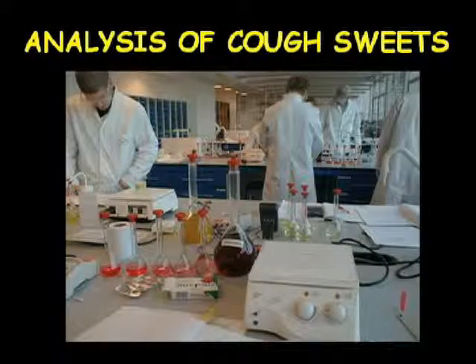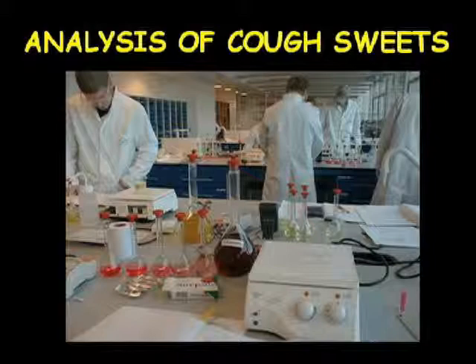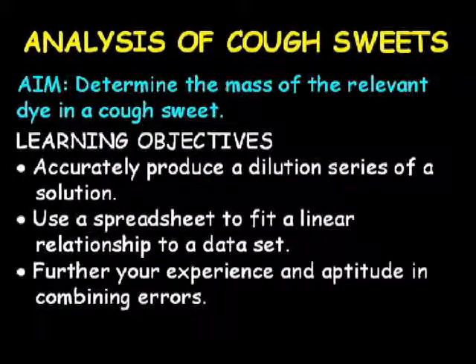This is an introduction to the Year 1, Semester 1 Physical Chemistry, Beer's Law and the Analysis of Cough Sweets practical. The aim of this practical is to determine the molar extinction coefficient of a food dye and determine the mass of it present in cough sweets.